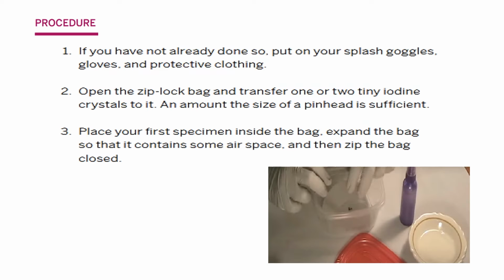Next, how to do the practicals? If you have not already done this practical in the laboratory and you are not familiar with it, always wear splash goggles and protective clothing. That is very important. Now you have to open a ziploc bag and transfer one or two tiny iodine crystals to it. An amount the size of a pinhead is sufficient. This much is enough.